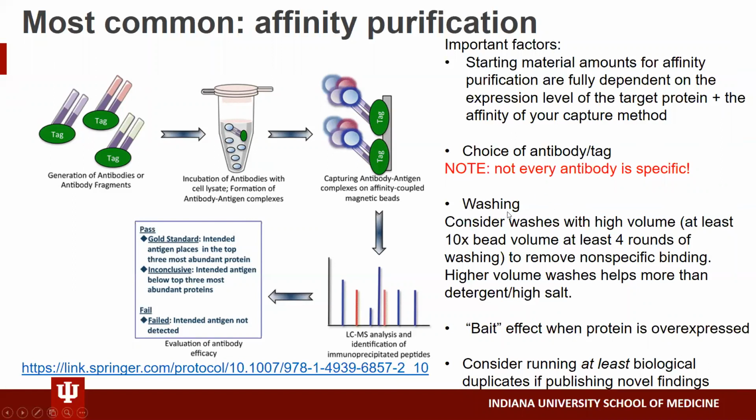Washing of your pull down is also very important. We definitely consider a large volume of washes, at least 10x your bead volume, at least 4 rounds of washing, to remove nonspecific binding if you want to ID something, a specific protein.